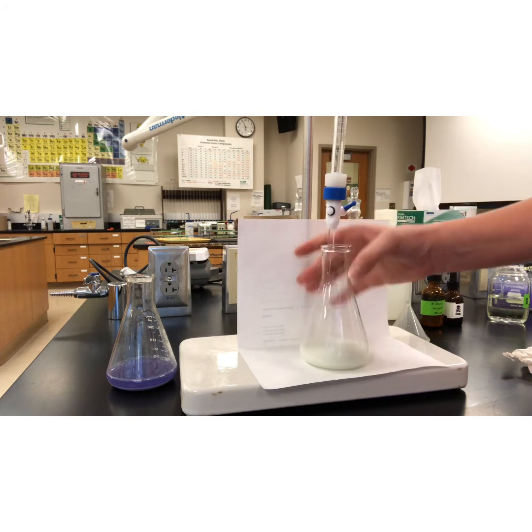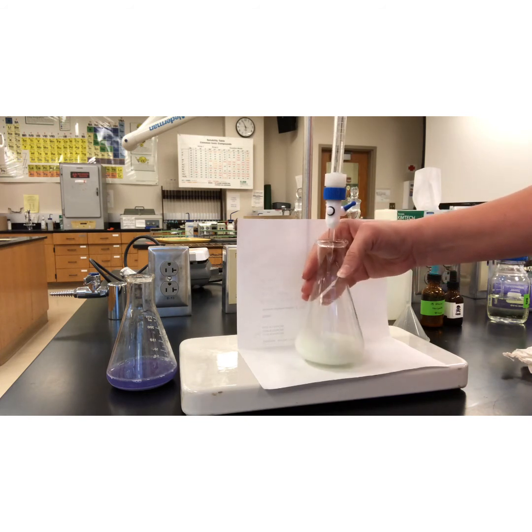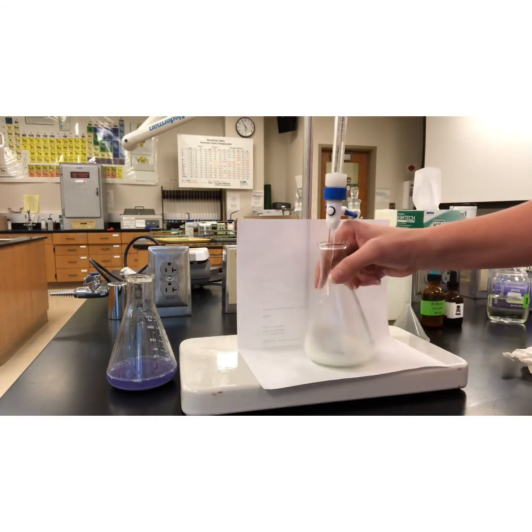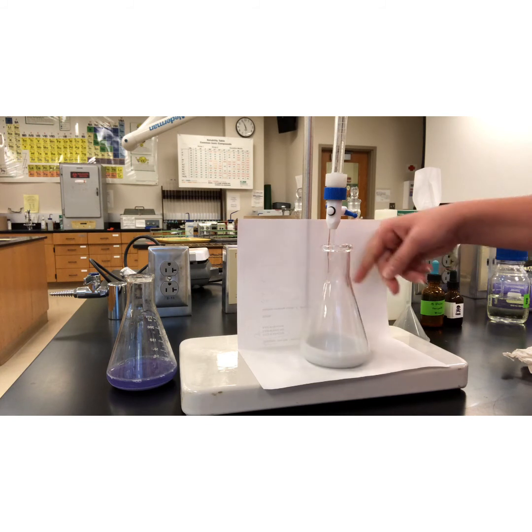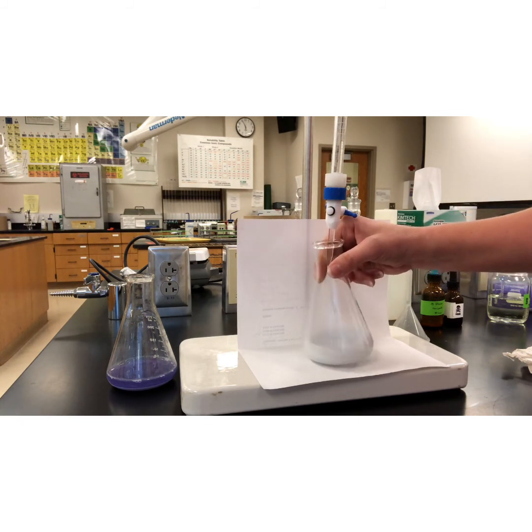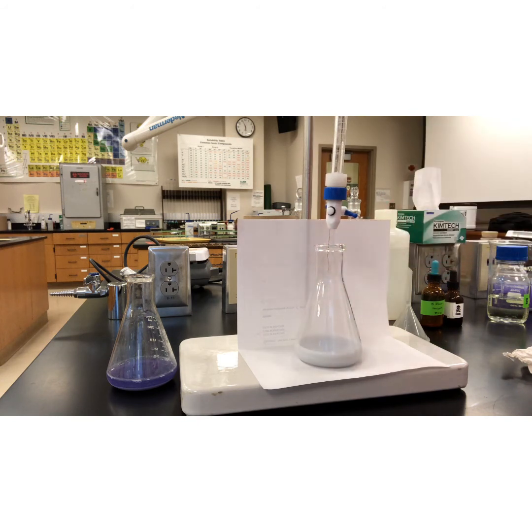Not quite yet, I added some more. Color changed back, it didn't stay. Why is it dripping? All right, there we go. We definitely have our color change now. That is, let's say, 18 on the nose. 18.00 milliliters.